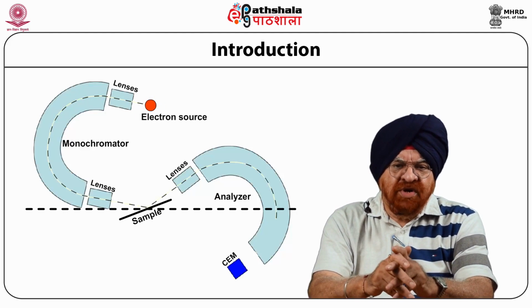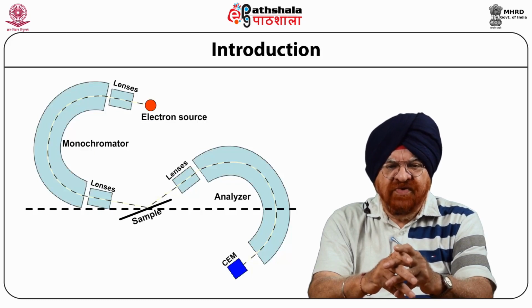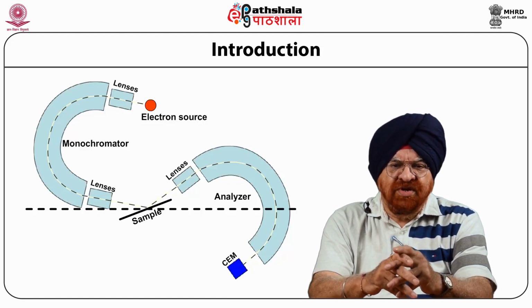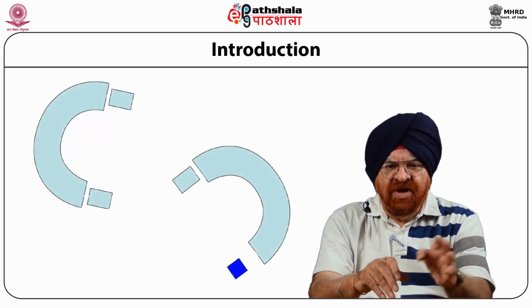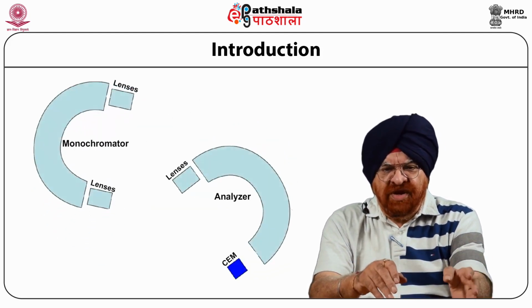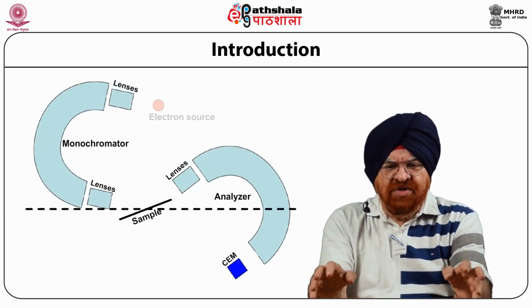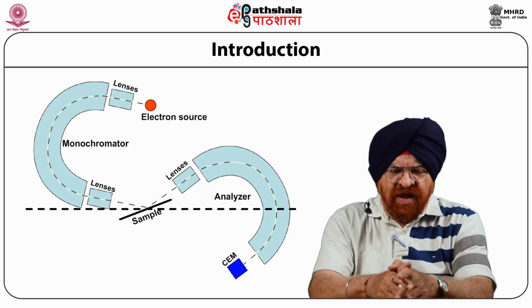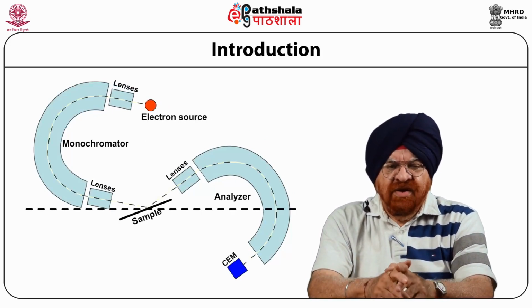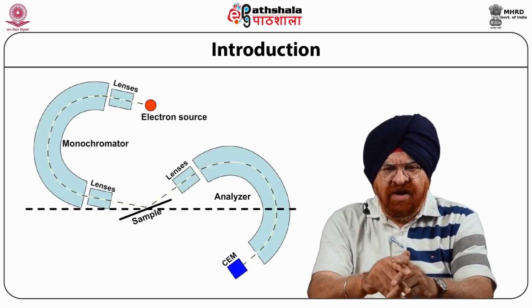One of the most important applications of HREELS is the investigation of adsorbates on crystal surfaces with many interesting aspects ranging from fundamental surface science to applications related to certain questions, for example, in the very important area of catalysis.